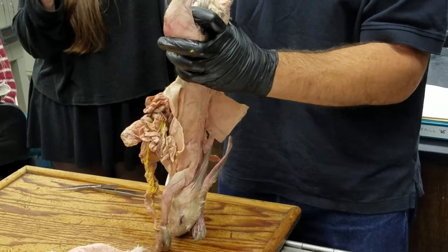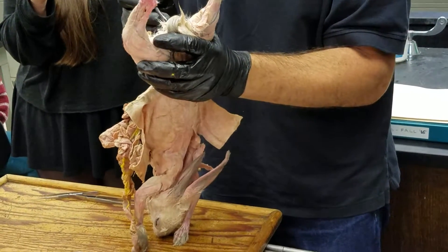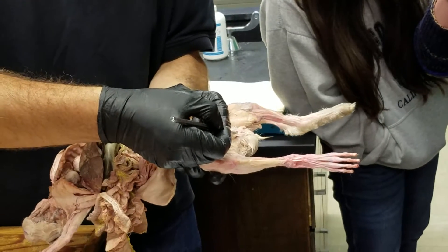The penis itself isn't fully exposed, but you can see the tip of it right here.